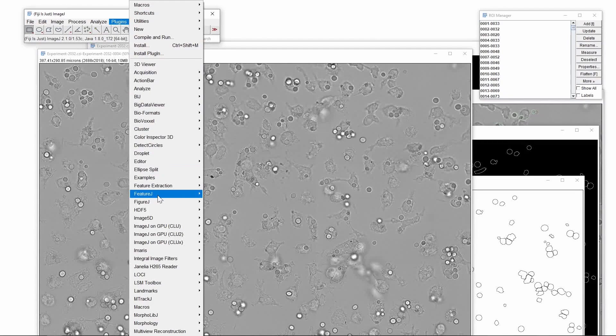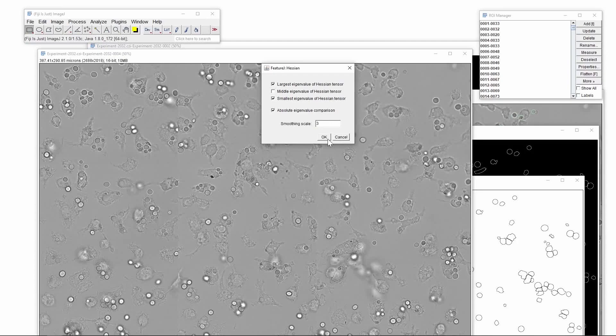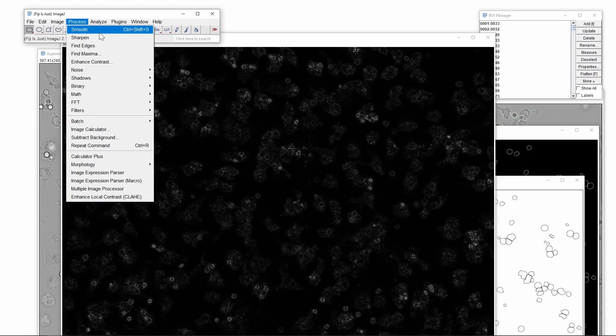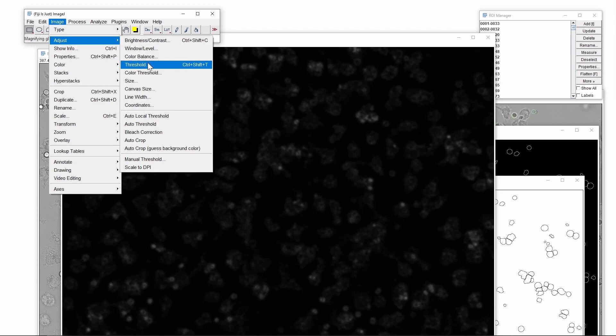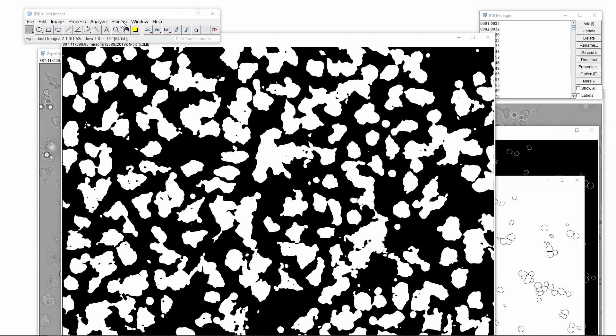Namely by applying a so-called Hessian filter, which calculates the second derivative on the spatial plane. This will reveal those objects which are surrounded by a curved outline, which is exactly what the macrophages are. By applying the Hessian filter with the radius of 3 pixels, we will generate a contrast which emphasizes the location of each individual macrophage. Here we will only use the smallest eigenvalue images and we will apply a 5 pixel Gaussian blur filter. In the next step we generate a binary image by using global thresholding, namely the Huang method.